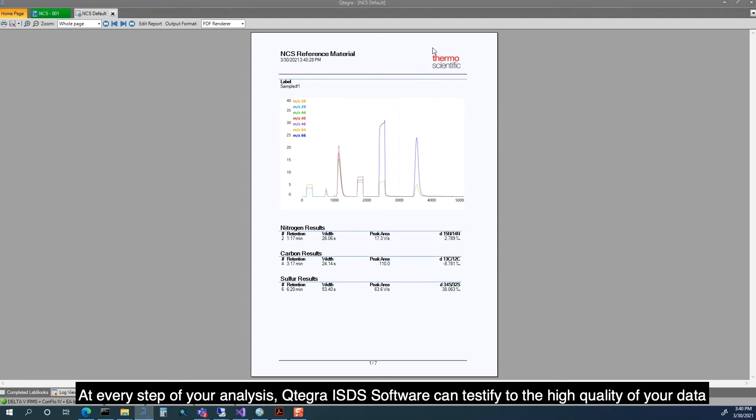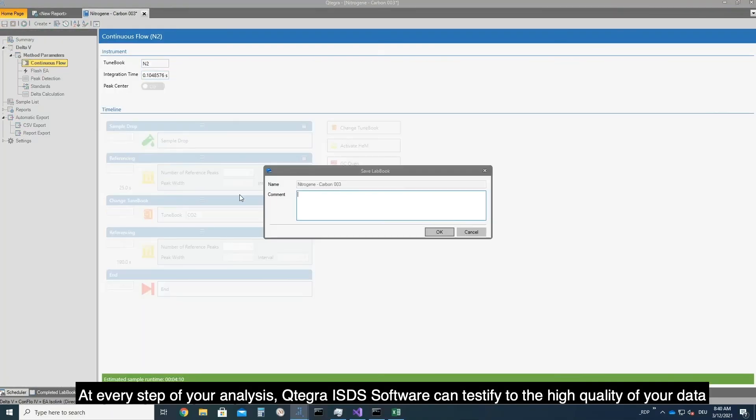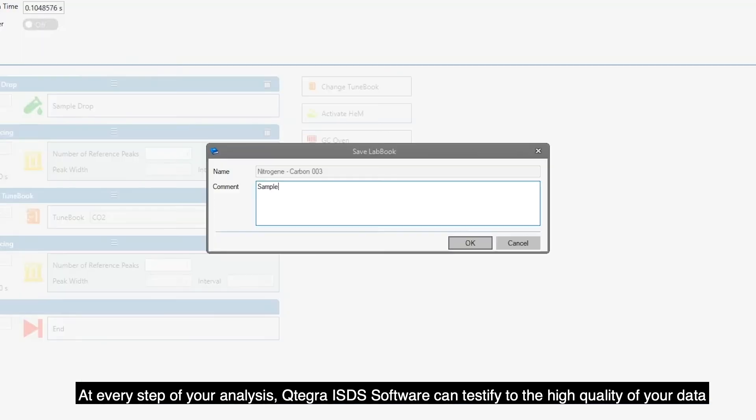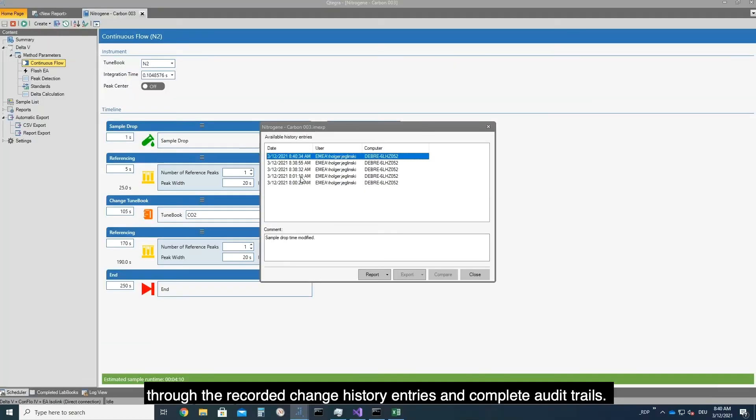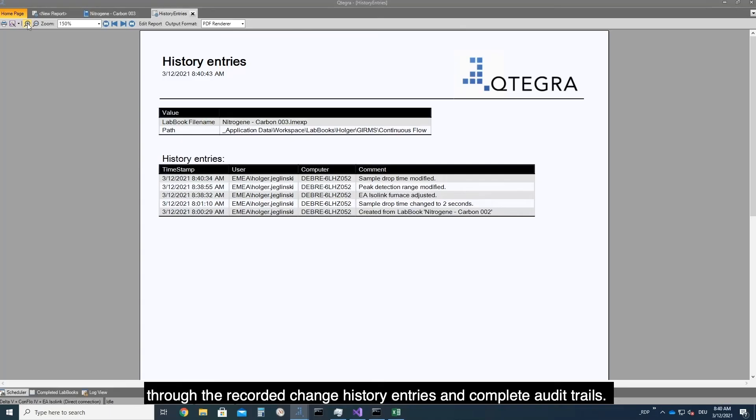At every step of your analysis, Qtegra ISDS Software can testify to the high quality of your data through the recorded change history entries and complete audit trails.